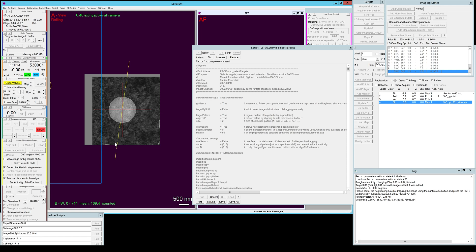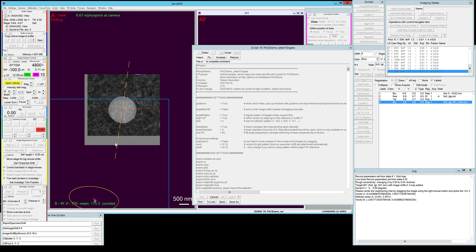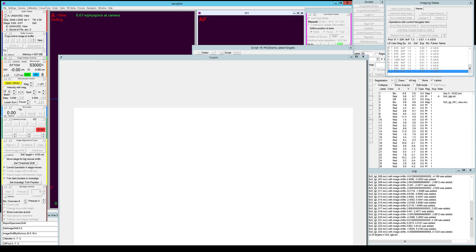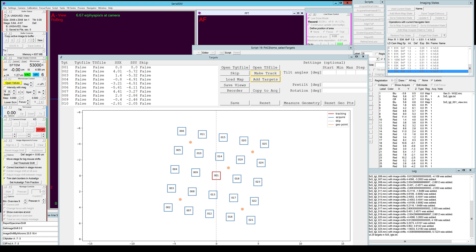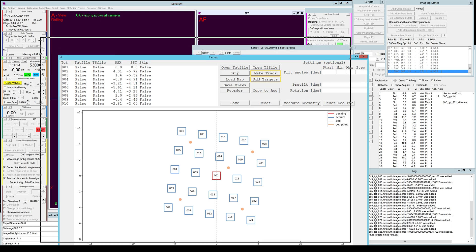As you can see it found the holes nicely even though the hole was broken and it refined the vectors. After that it set up all 25 targets and opened the graphical user interface here.